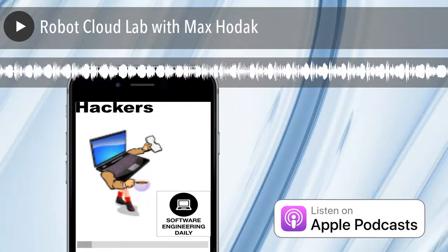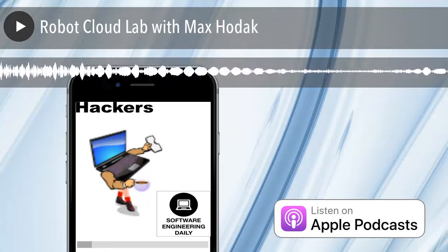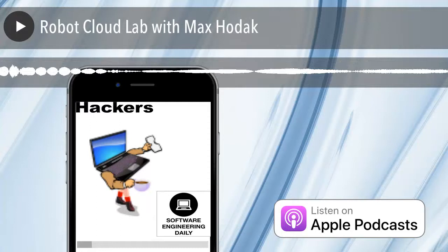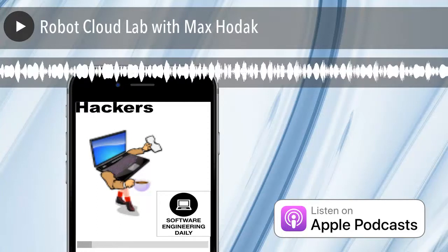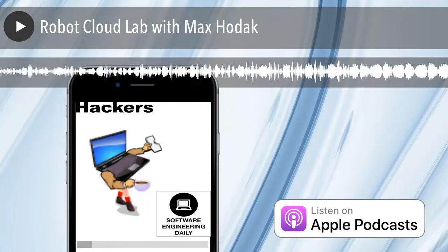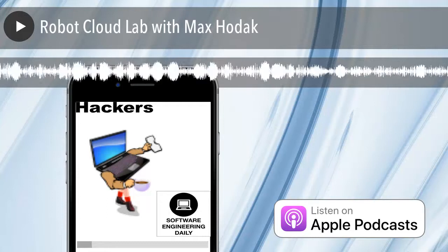So give me an idea of the integration process, because I've seen the videos of this robotic arm interacting with these machines that you bought off the shelf, and I'm thinking probably these machines did not all have beautifully well-formed APIs, and you probably had to do some hacking to open up the interfaces for some of these machines. Yeah. You have no idea.